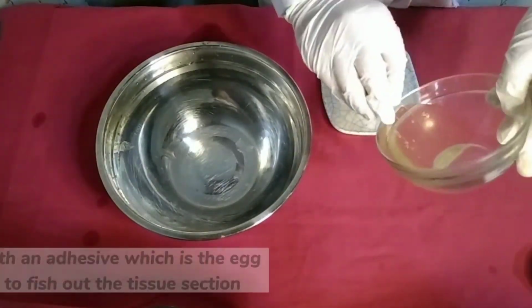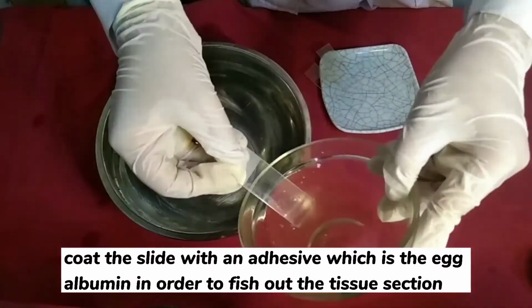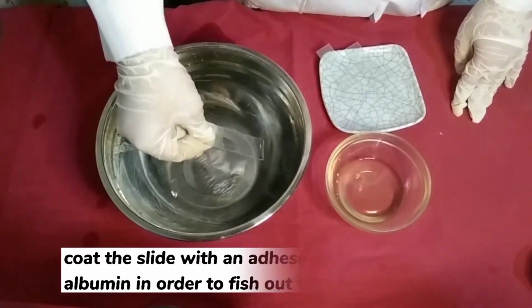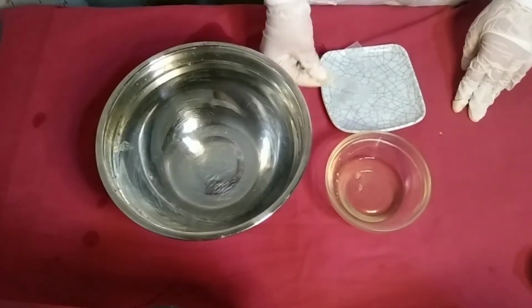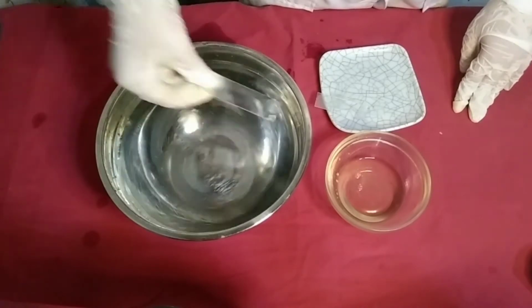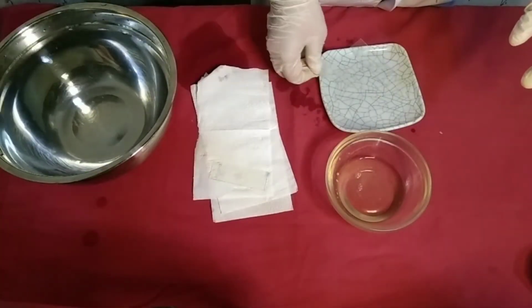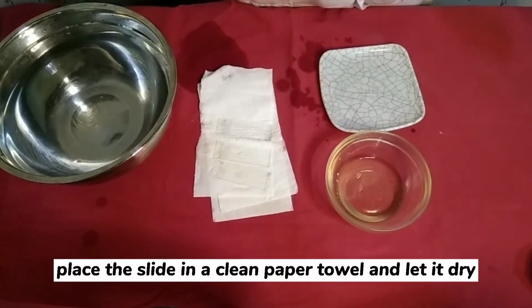So next, I am going to coat the slide with an adhesive, which is the egg albumin, in order to fish out the tissue section. In fishing out the tissue section, place the slide near it and carefully fish out the section in a vertical way. So now let's place the slide on a clean paper towel and let it dry.